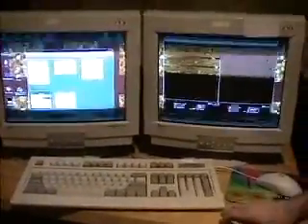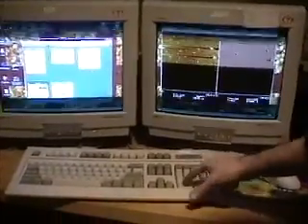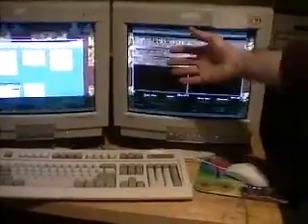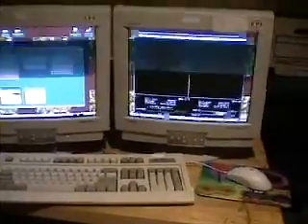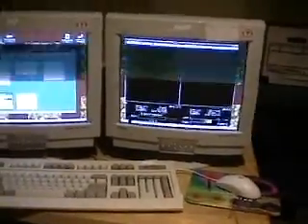So I could type in 40 nanometers, and suddenly the contrast changes because the Z scale is bigger. If I type in, let's say, 150 nanometers, then the contrast becomes even worse. If I type in 5 nanometers, then there's too much contrast. So you adjust that so that it gives you something that looks relatively nice. That's cosmetic only. It only affects this display. It doesn't affect how the data is saved.